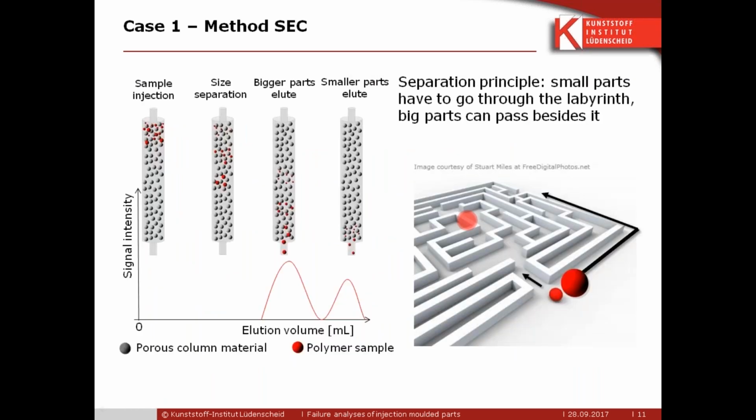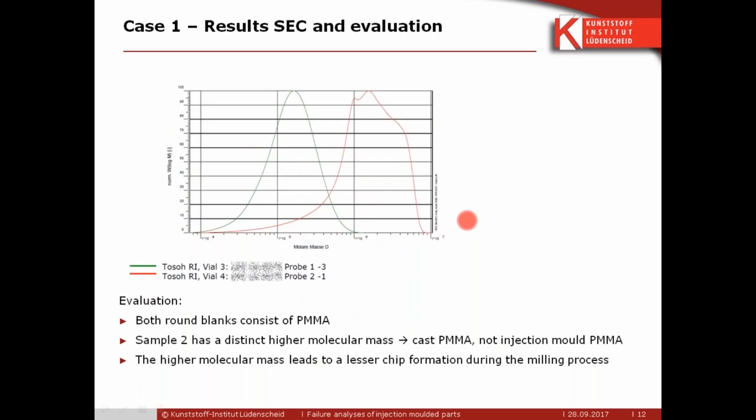Yes, it's also thinkable, but cannot be excluded. But you need a process where you don't have problems with very high viscosity. It's not uncommon to produce such round blanks by cast process, so we assume a cast process is most likely, but compression is also thinkable.